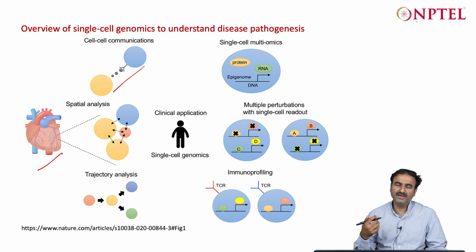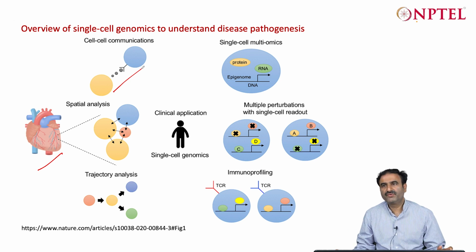So far we have been generating data for the entire tissue where multiple cells were broken together, and all the mRNA and genome get mixed up, because the assumption is that the RNA profiles will also be the same, although the genome will be the same, right, but imprinting may be different, okay. So in single cell genomics we are talking about each and every cell. So by knowing that, we can now interpret the cell to cell communications.